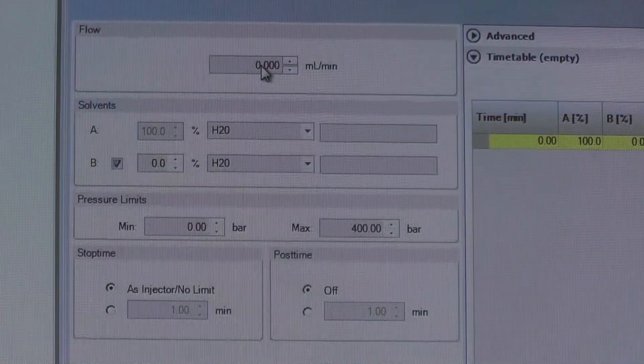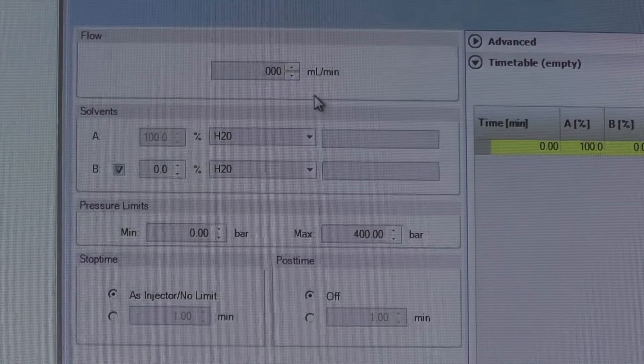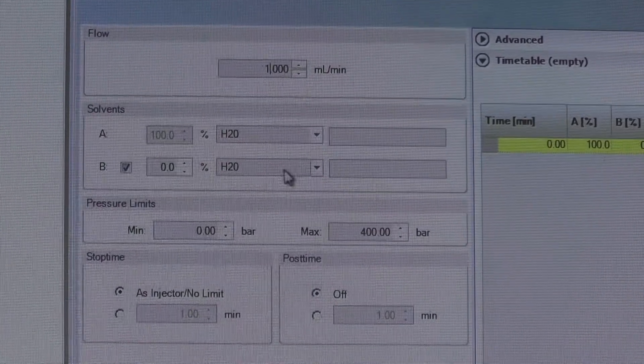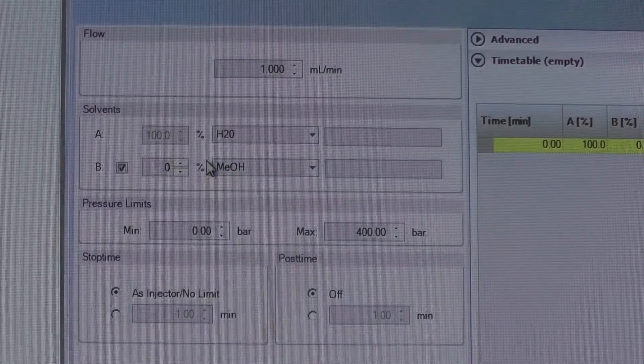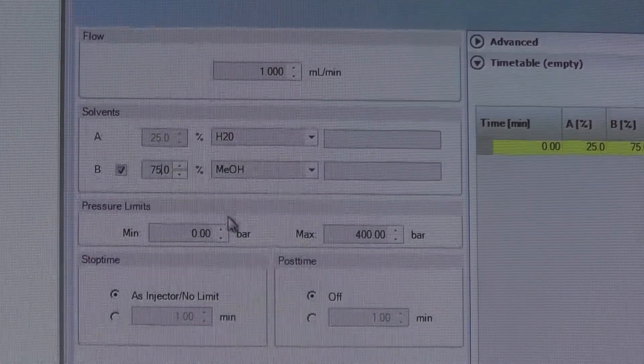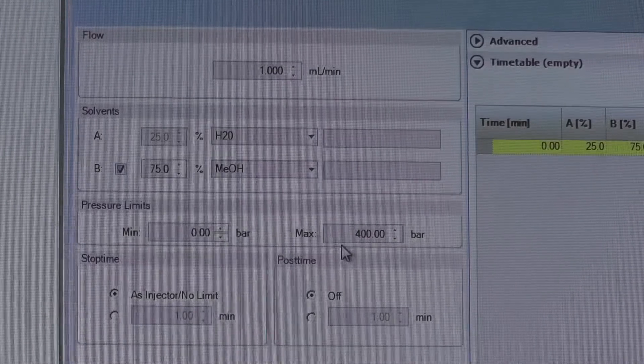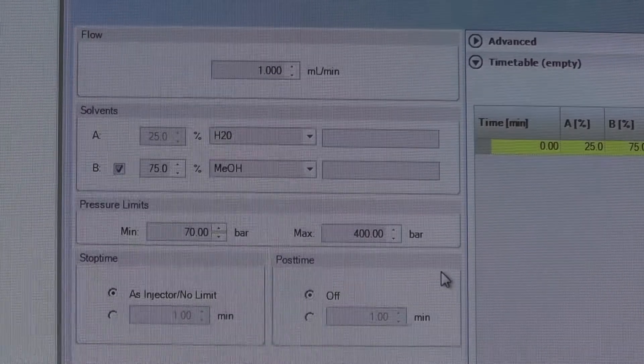A binary pump setup window will show up next. Change the flow rate and the solvent gradient according to your experiment. You can also change the minimum pressure limit to 70 bar or based on your own needs in order to detect leak in the system.